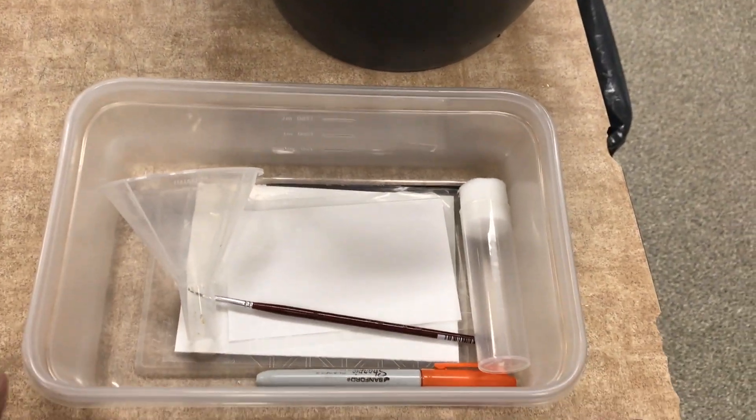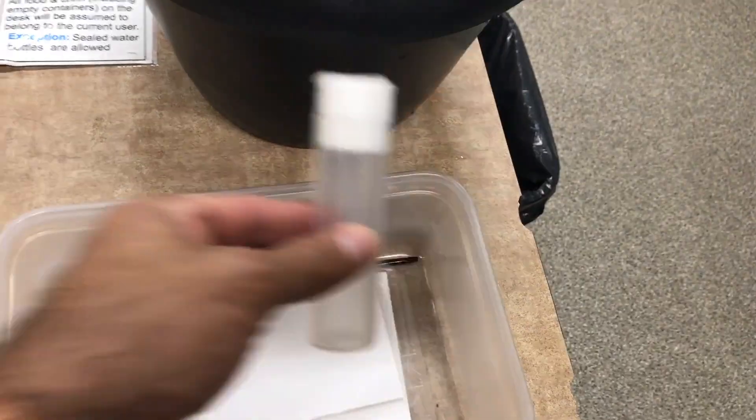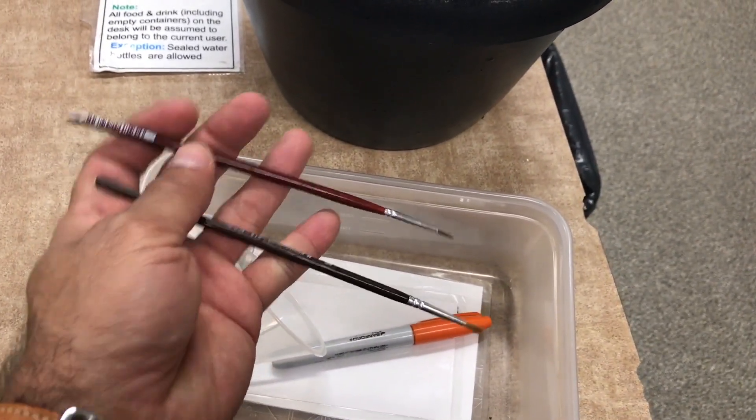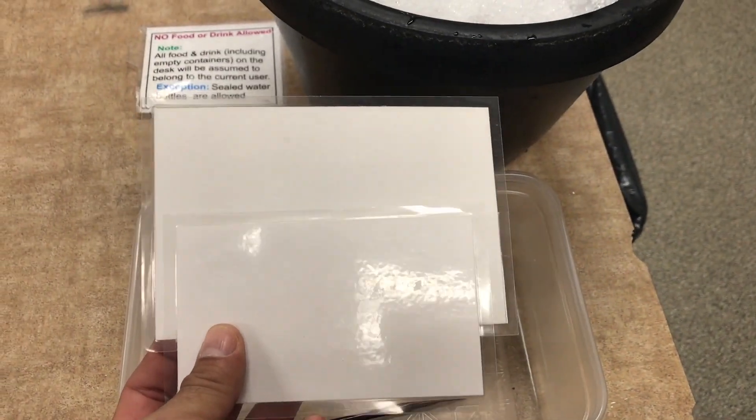All of the things that you need are here in this bucket: a funnel, an empty vial, two paint brushes, one marker, and two cards.